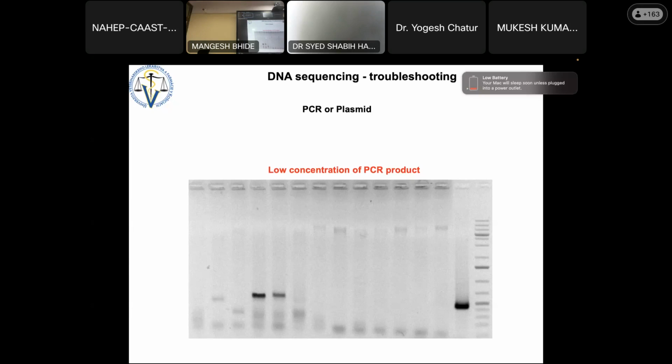And stack the slabs. Those slabs can remain in the freezer several years, at minus 20. Then if I want 200 milliliters of the agarose, I will take one slab, I will cut it, I will put it into the microwave oven, and the gel is there.